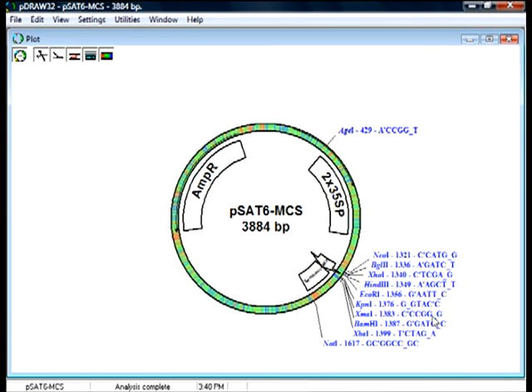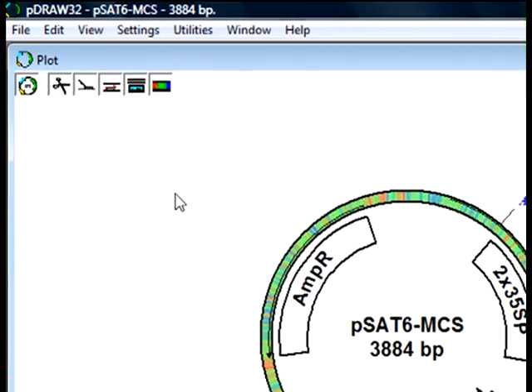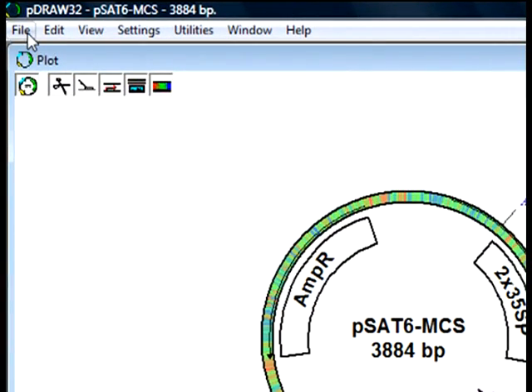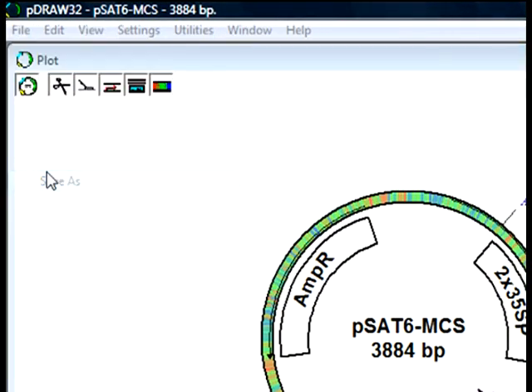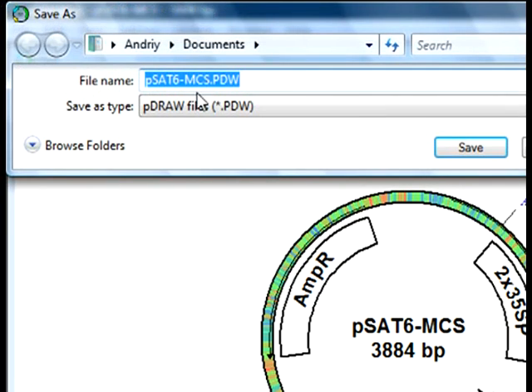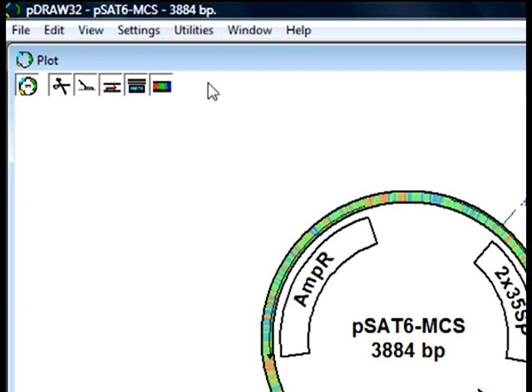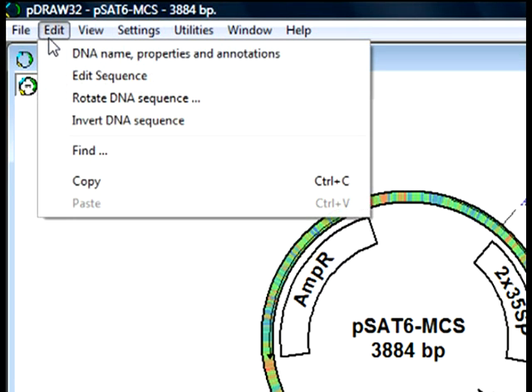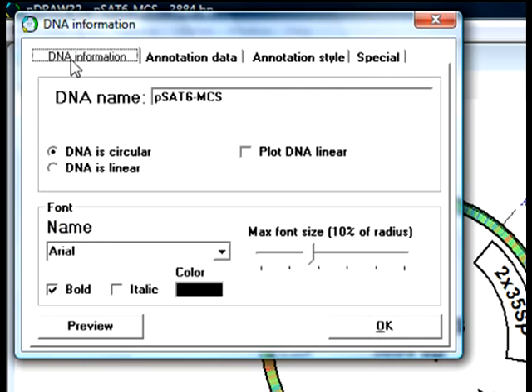Now I'm going to build a map of PSAT6BAR by pasting the sequence of the bar gene into the PSAT6MCS. Let's first save this map as PSAT6BAR. In P-Draw32 we need to separately edit the plasmid name, because it's not automatically imported from the file name.